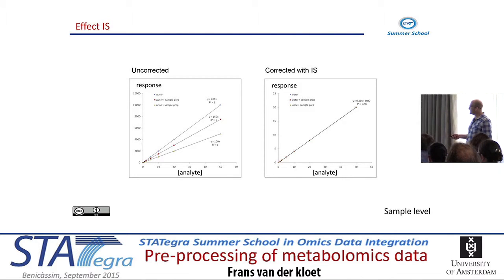and remove the variation introduced by sample preparation and analytical variance.